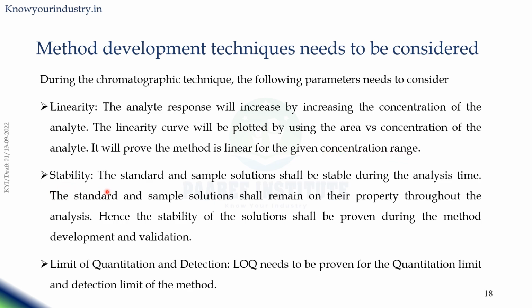Then the standard and sample solutions shall be stable during the analysis time. So you are injecting the first sample at the first minute, and maybe the 20th sample goes after a couple of hours, or the 6th or 7th hour. So the analyte stability in the sample is very critical here. Even at the 7th hour, whatever concentration was initially present should be the same. It should not degrade or be lost during the period. There should not be any loss of analyte.